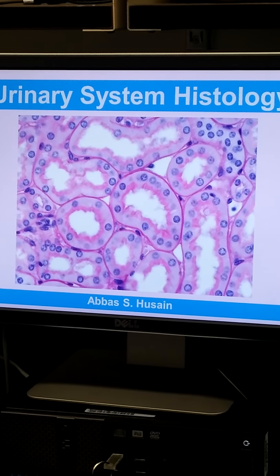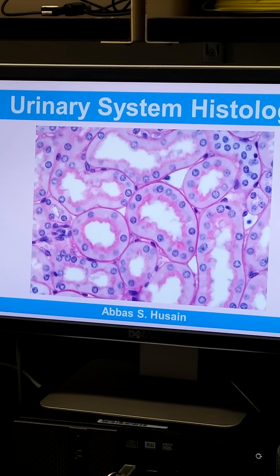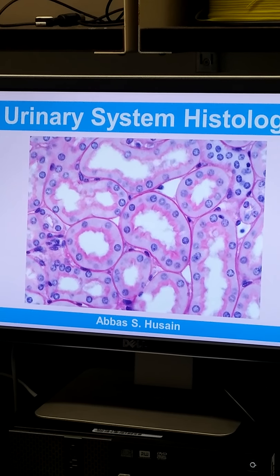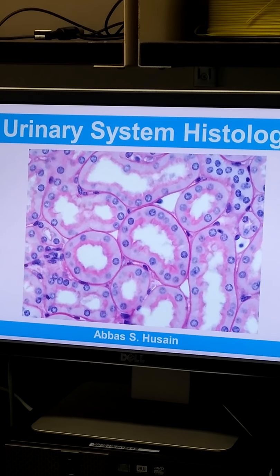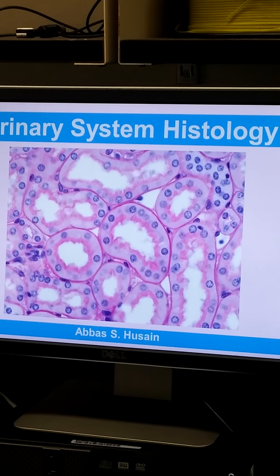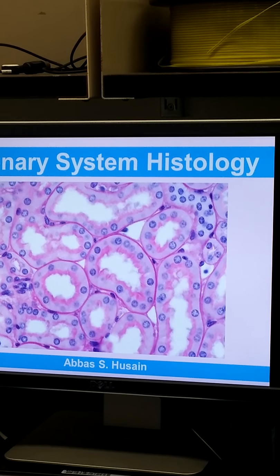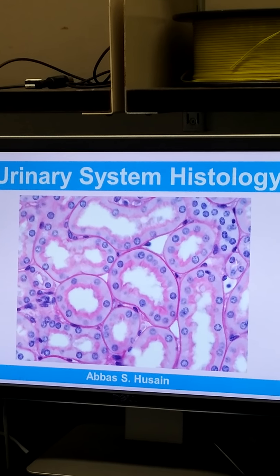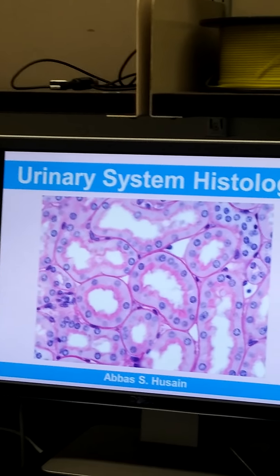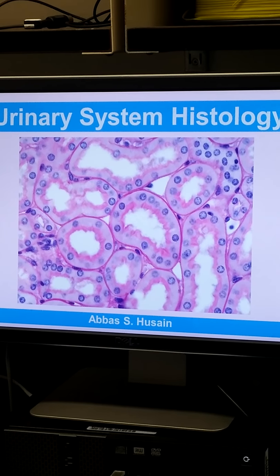So urinary system. What is that? Well, by the time I'm done talking about these slides, after about 15-20 minutes, when I say, what is that, all of you will yell out the answers and you will know. Is it a kidney? Okay, Brianna, come here. Don't be lazy. Okay. Yeah, it's a kidney. It's a cross-section, and it's a cross-section of the tubules.